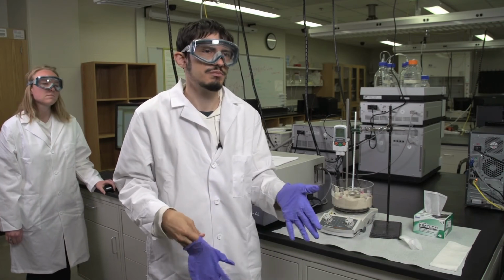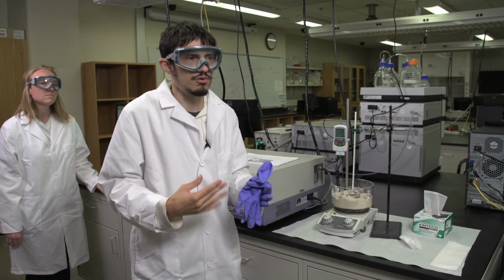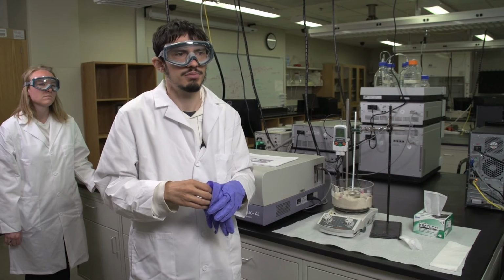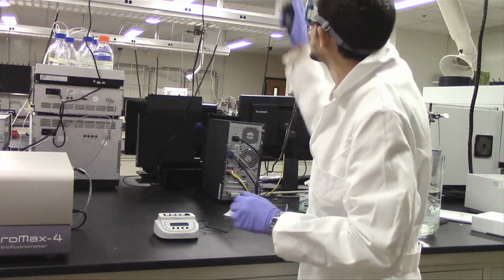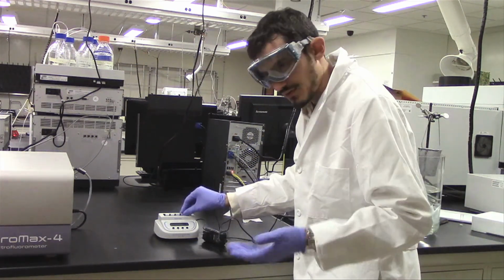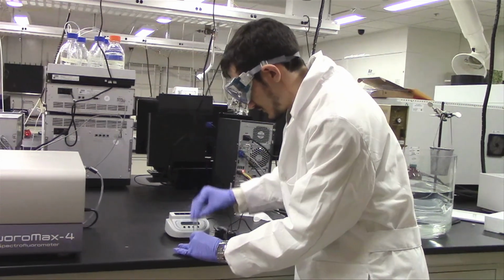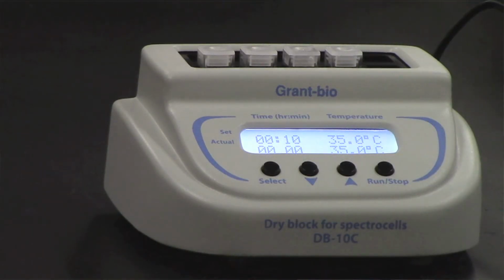Be particularly patient with this part of the experiment, as the temperature control is very important, and also being sure that you get all your data points so that your nonlinear fit later in the analysis will come out properly. So to end it, all you have to do is unplug this from the outlet and make sure at the very end that you remove all of the cuvettes from it, and then store this in an appropriate location.